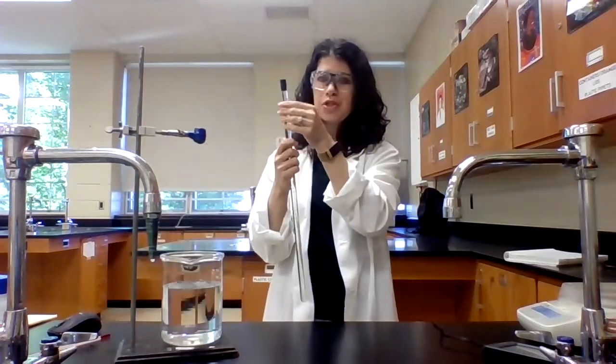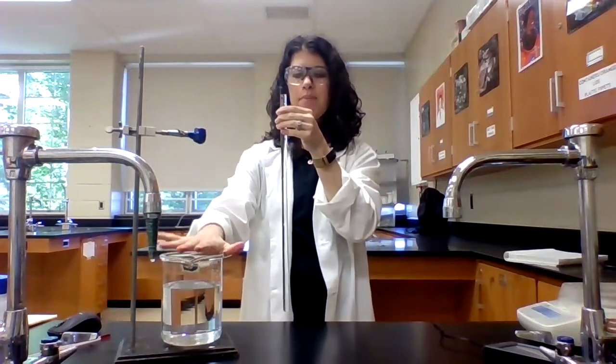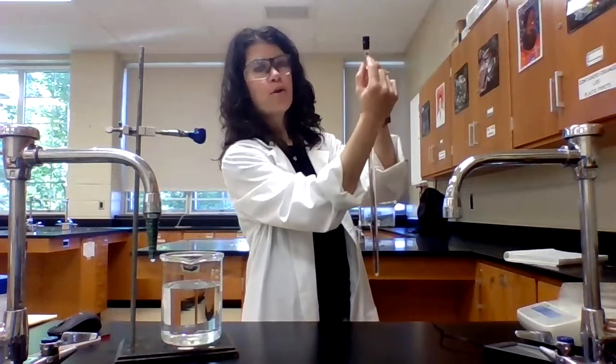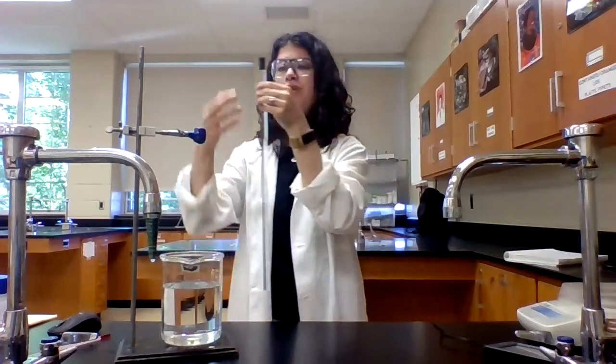So now what I'm going to do is I'm going to invert the eudiometer and place it inside my beaker. And when I invert it, the hydrochloric acid that's here is now going to travel to the bottom where my magnesium ribbon is now trapped. Then a reaction will occur and we'll see the bubbles form, which is the formation of hydrogen gas.